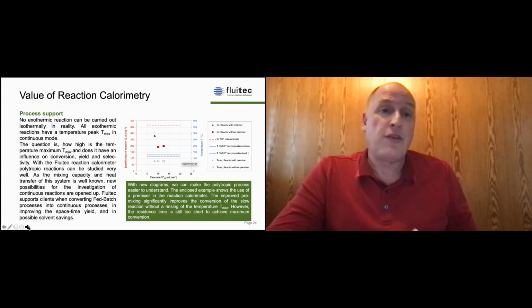Then the process support. After such a screening, we can talk with the client. We are making analysis, and we developed this diagram, which you can see here. We look at the specific heat of the reaction, and we do some analysis on temperature, for example on the T onset temperature, or we compare with measurements from the RC1.